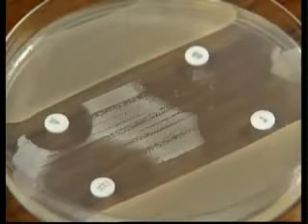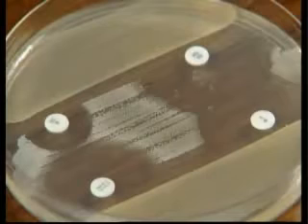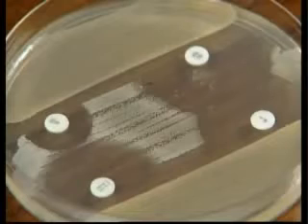Following incubation, the growth of the test and control bacteria can be observed. If the test has worked successfully, the control strain will fail to grow in the area close to each disc. This is because active antibiotic has diffused out from each disc and has either killed the control bacterium or has inhibited its growth. If the test strain is resistant to the antibiotic, it will grow happily in its presence, and no zone of clearing in the bacterial lawn will be seen near the disc.